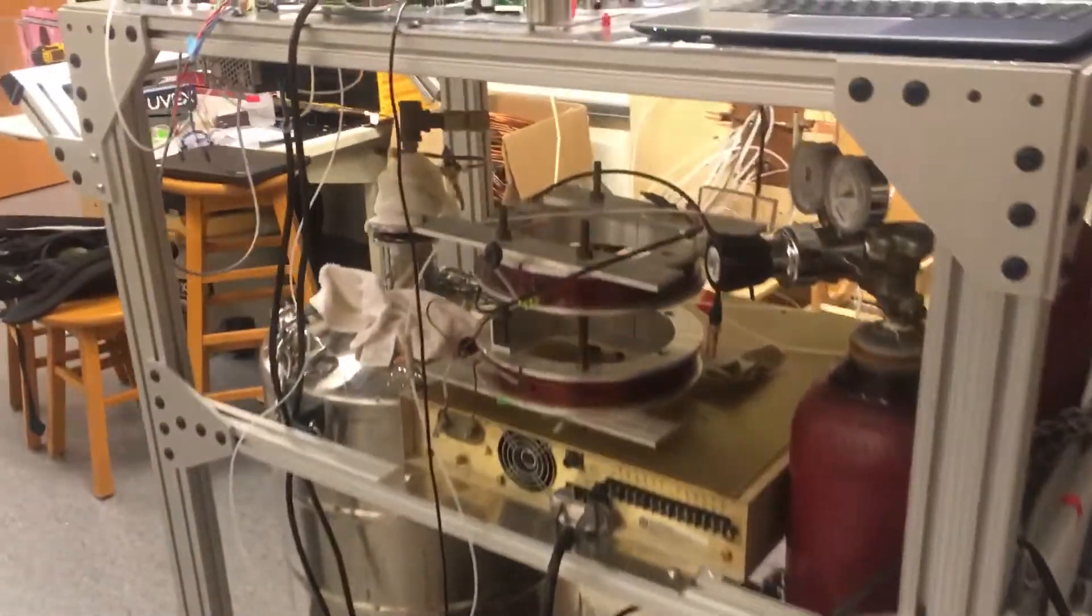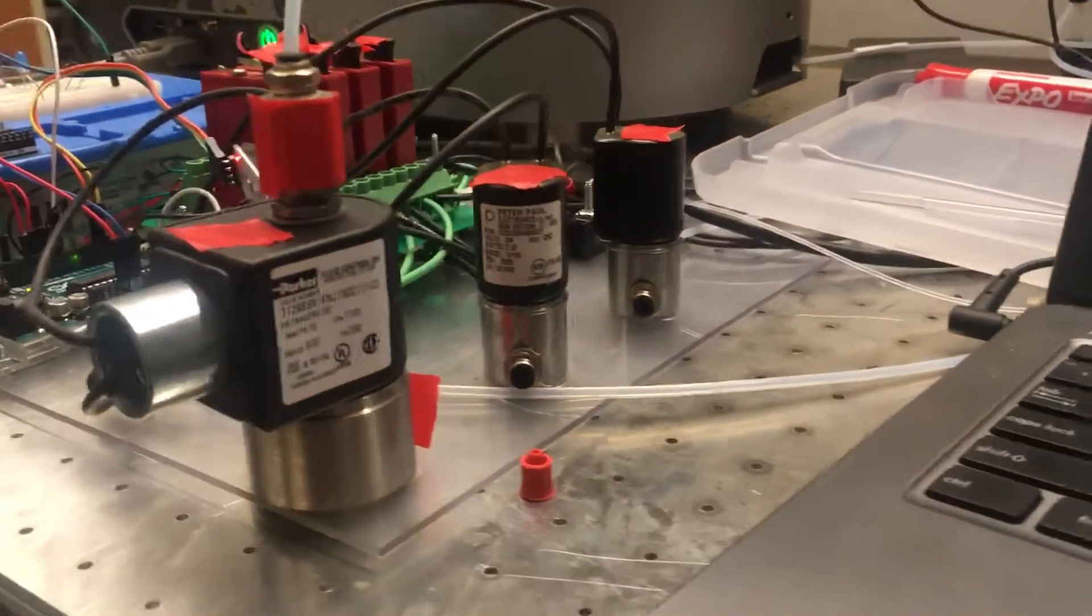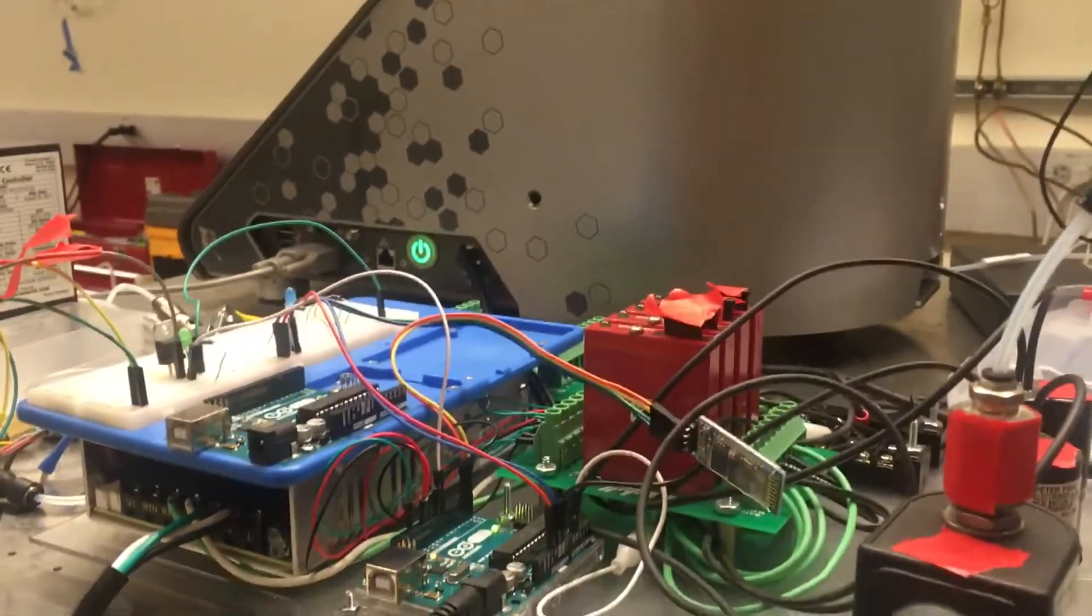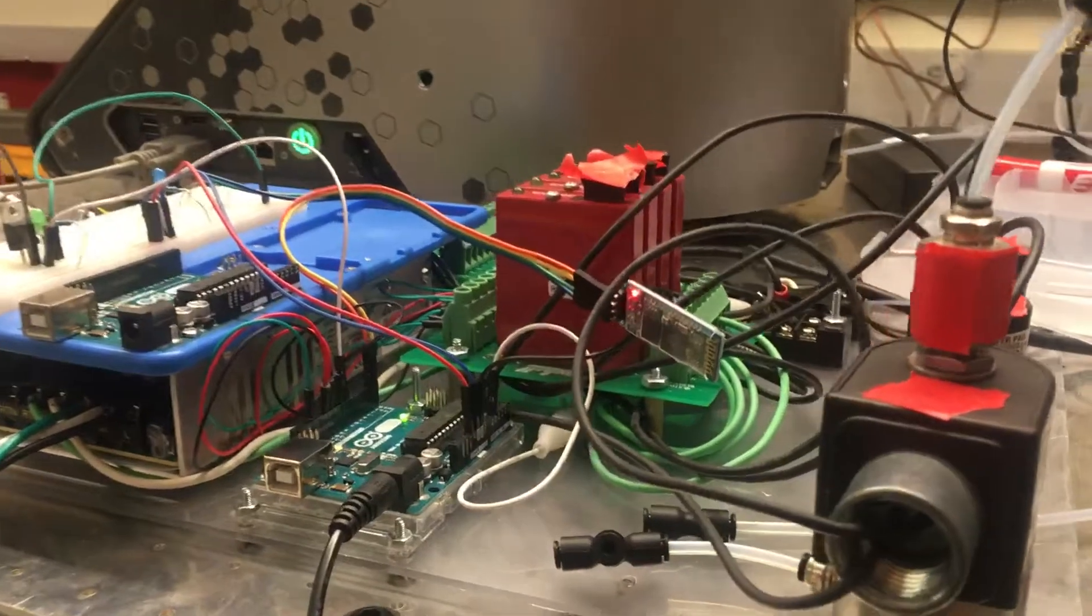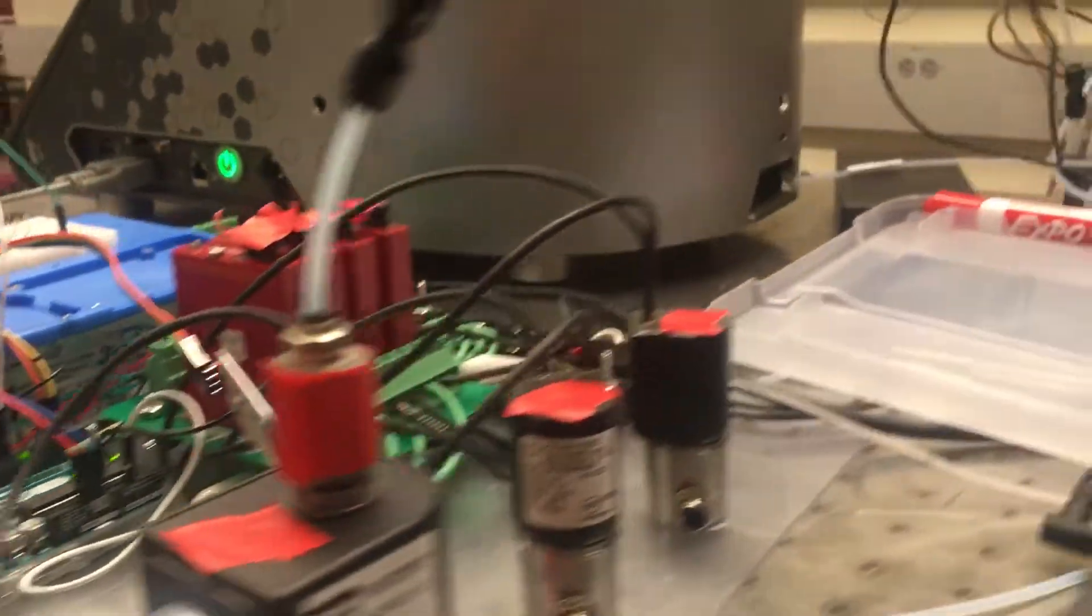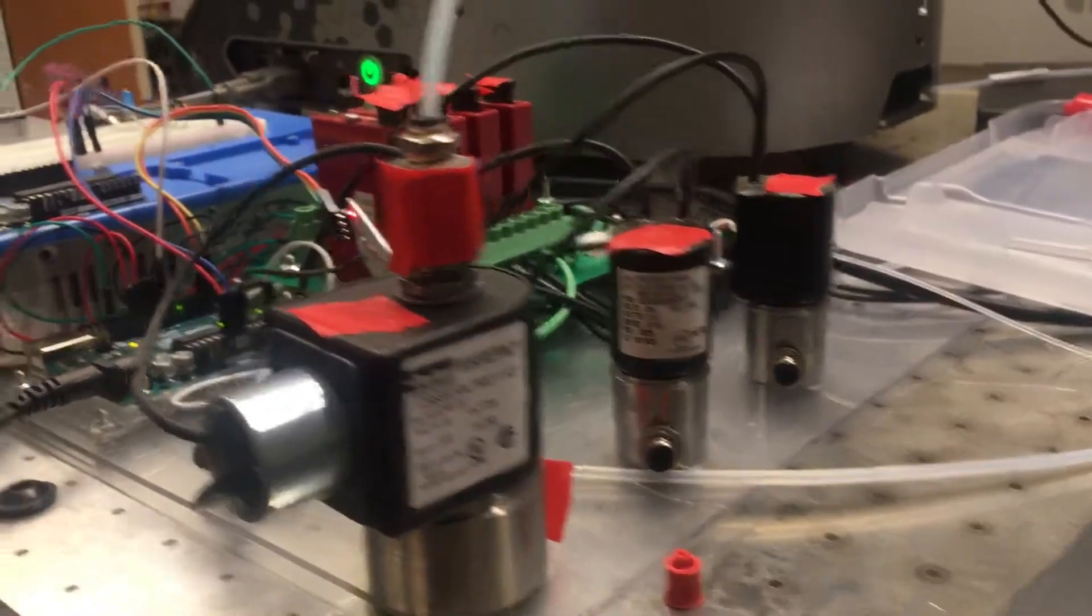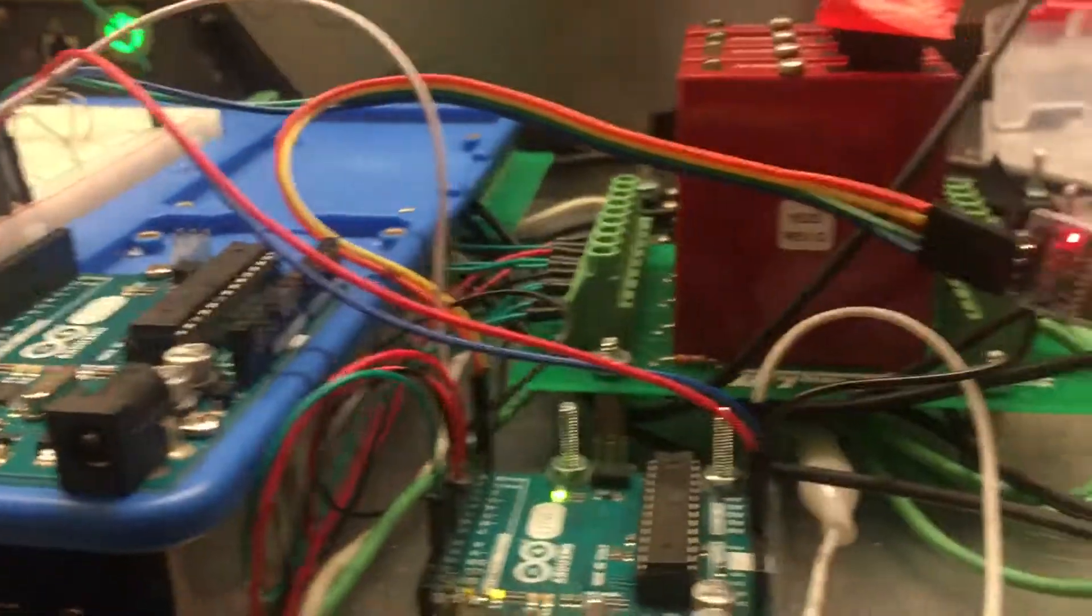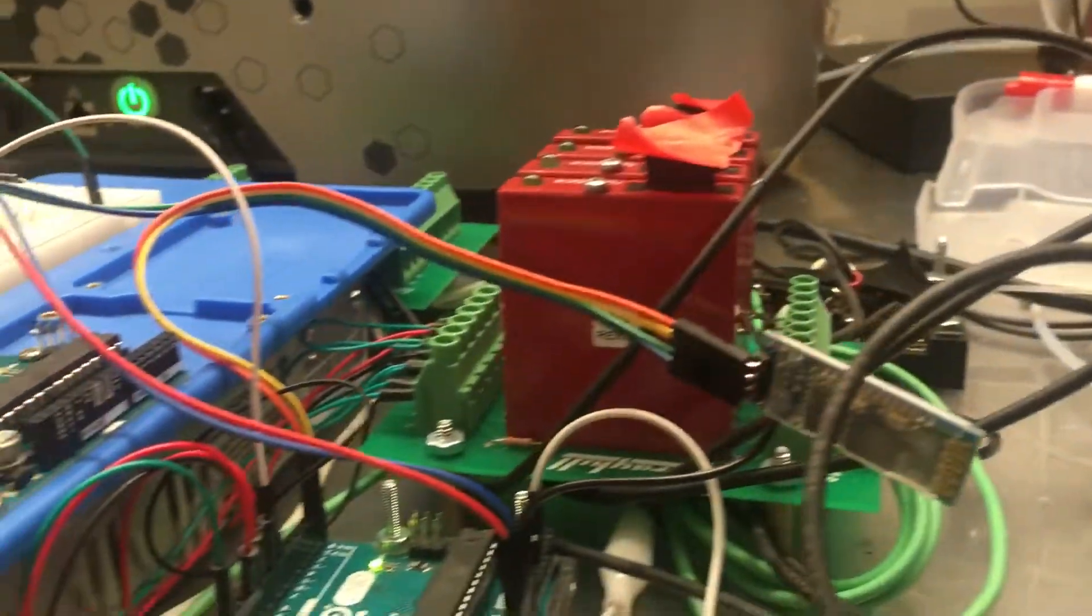The valves are controlling the fluid streams, and we'll cause some kind of sample preparation by opening and closing the valves in some kind of sequence, and then the sample will get piped into the NMR too. We'll actually run experiments and we'll cause the spectra acquisitions to occur at a set time.